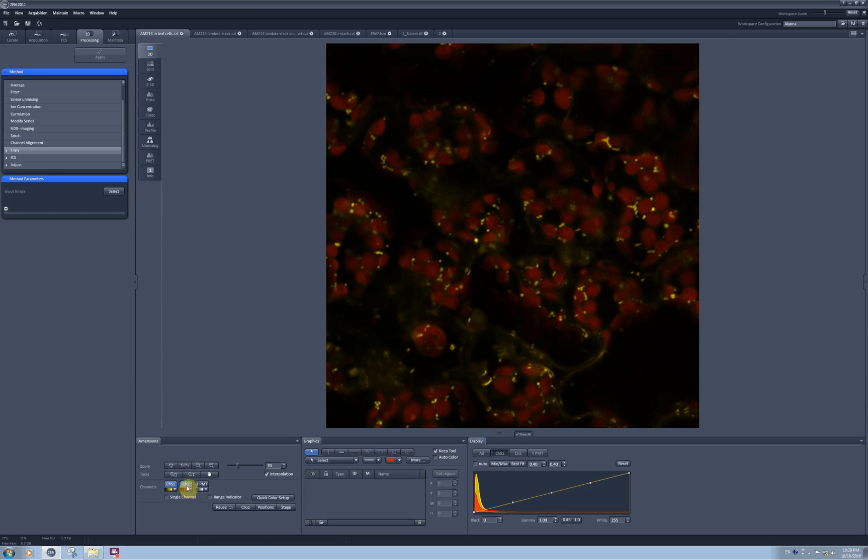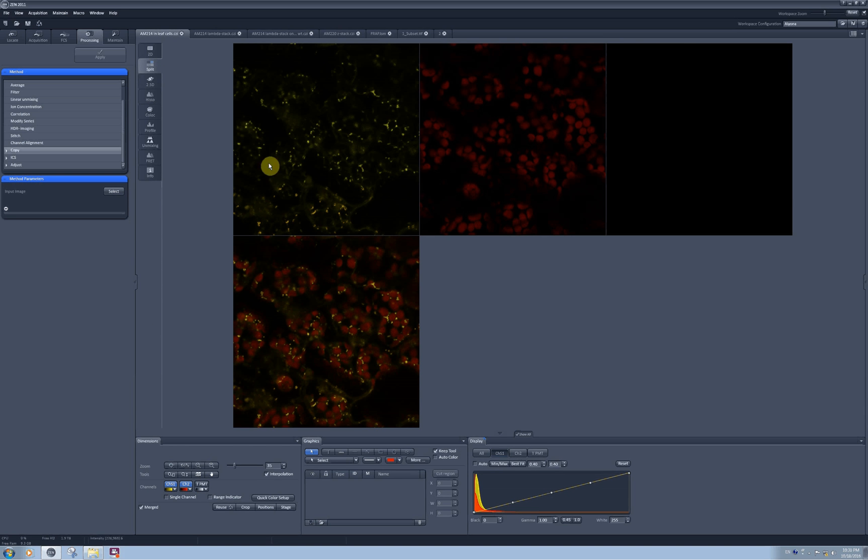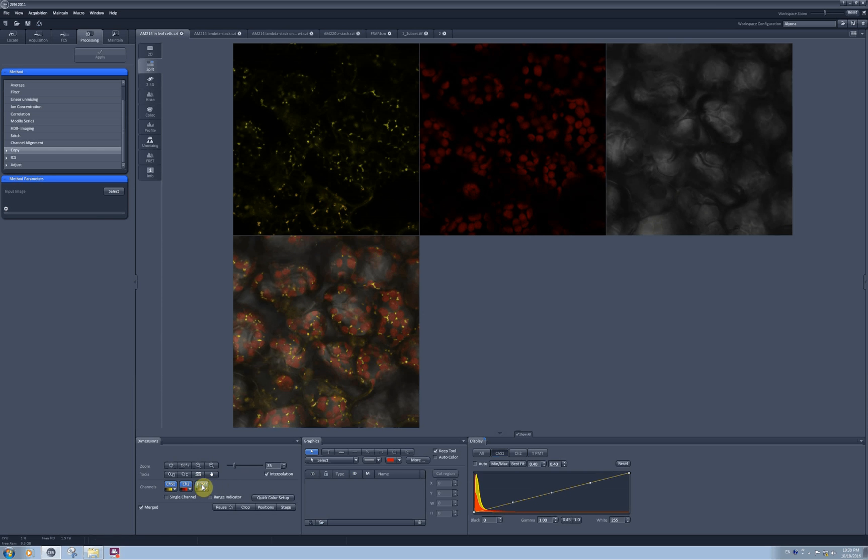When you open a picture which has two or more channels, you can perform linear mixing in this tab. First, I can show you that I was detecting here a mitochondrial marker fused to YFP and autofluorescence from chlorophyll, and also transmitted light image.